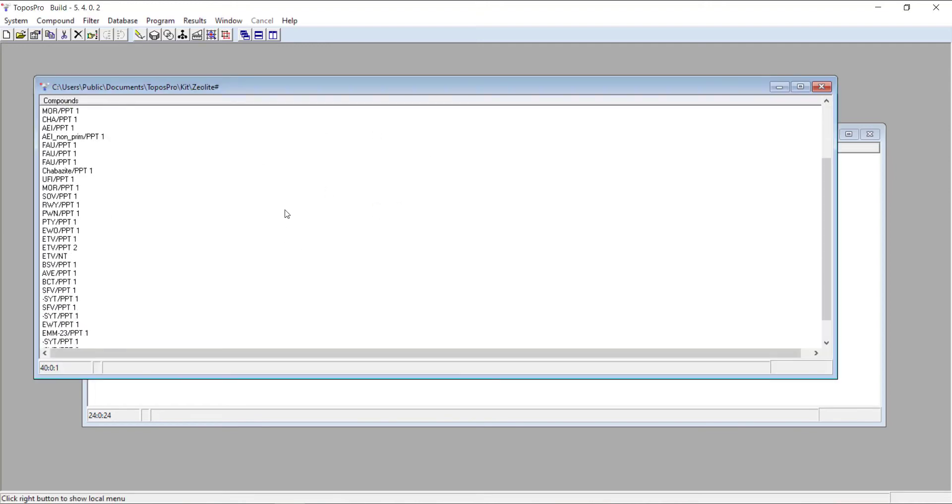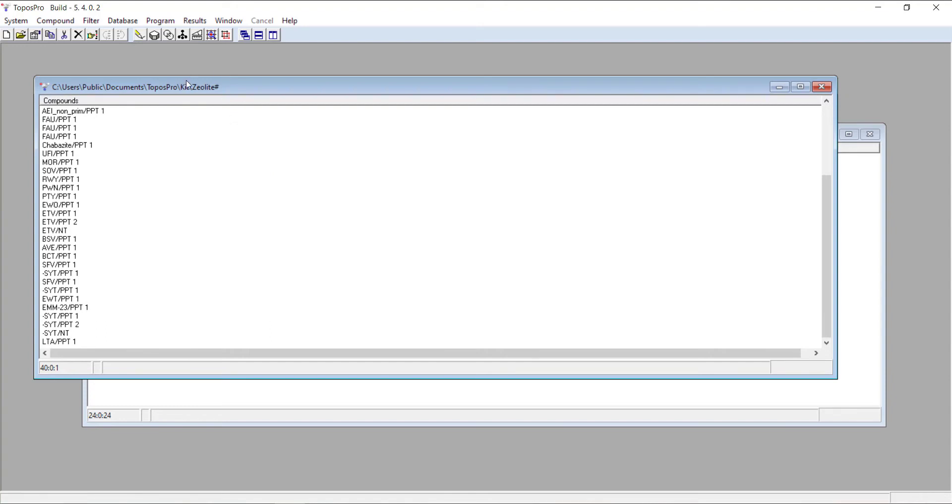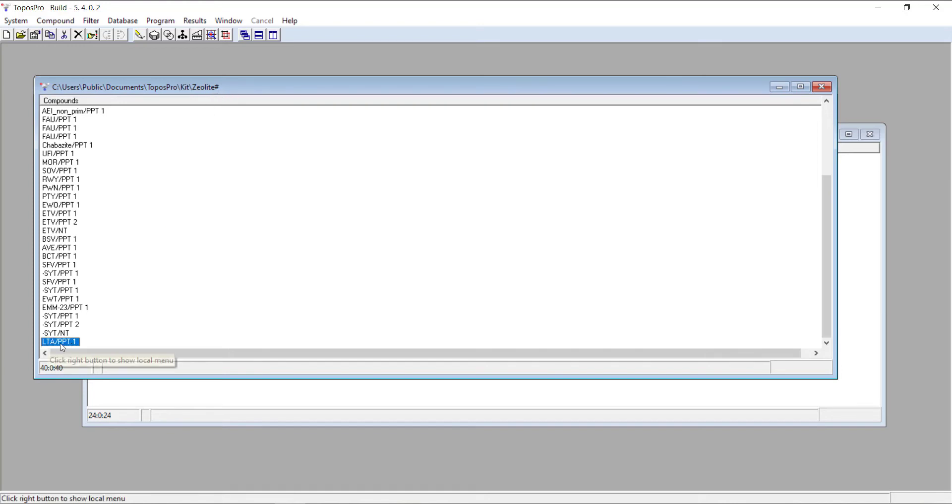Press OK. You can see it's running through the calculation. It also creates another child database, but this one will be called zeolite hash, rather than zeolite underscore c, which you would get with a simplified net. You can see we've got LTA that's been calculated here.